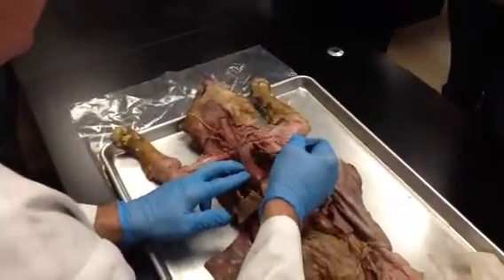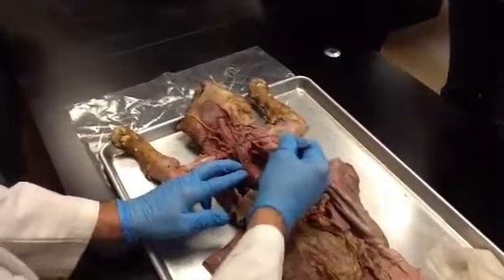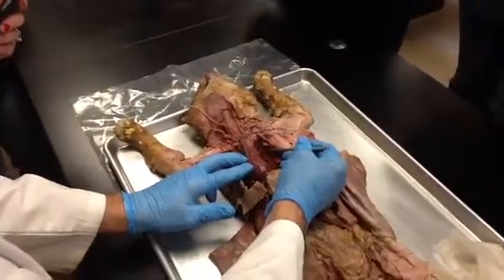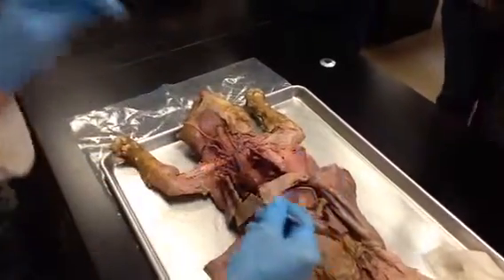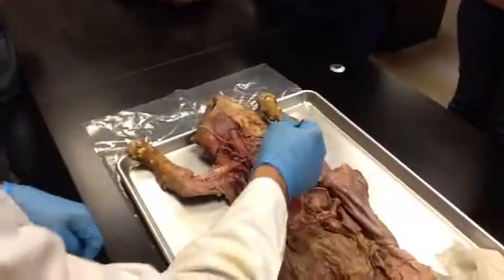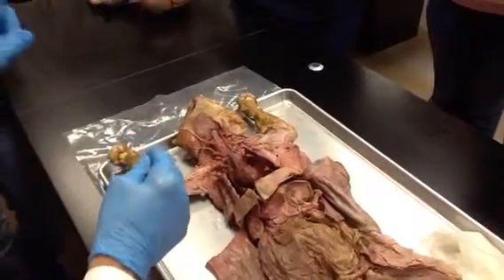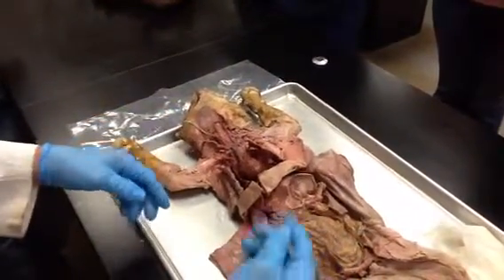right here. This is my aortic arch. As opposed to the human system where we find 3 vessels that originate at the aortic arch, on the cat we only have 2. We have a brachiocephalic artery and a left subclavian artery. That's the only 2 there are.